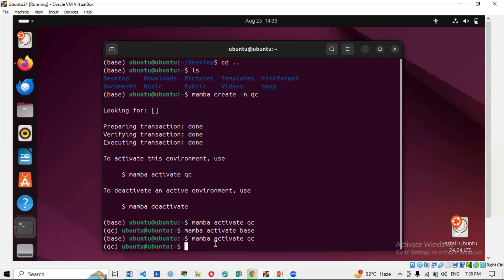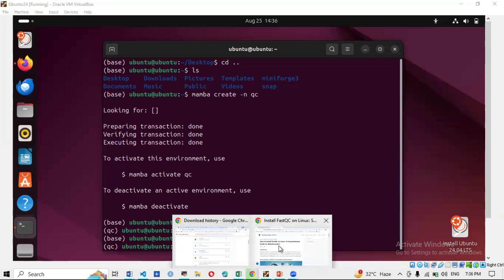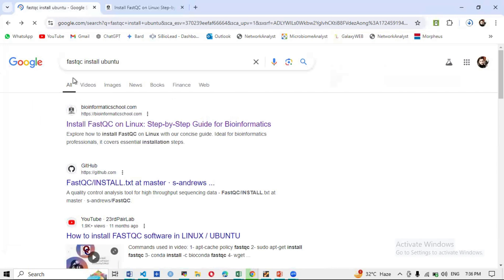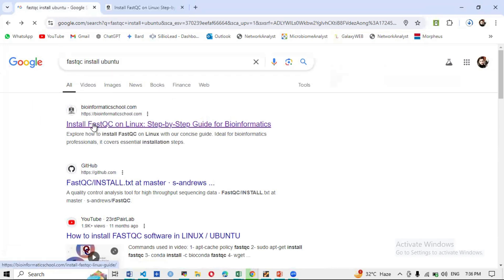FastQC is used for data quality visualization — you check the quality of your FastQ files. With the qc environment activated, we will now install FastQC. I'll show you manually how to find the command: go to Google and search 'fastqc install ubuntu'. Open the first link and you'll find the command there.